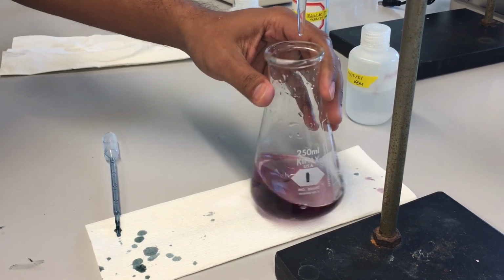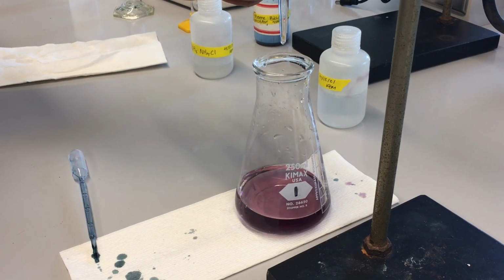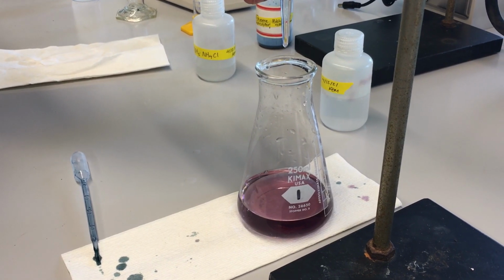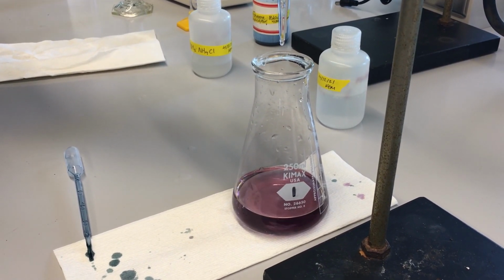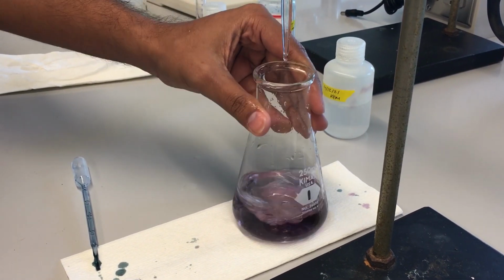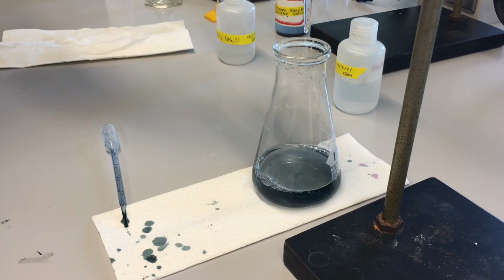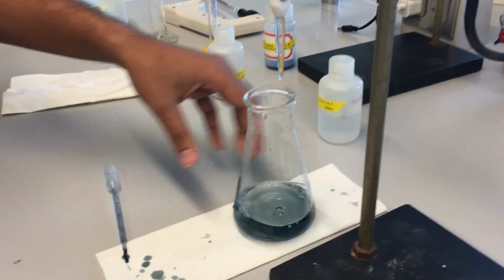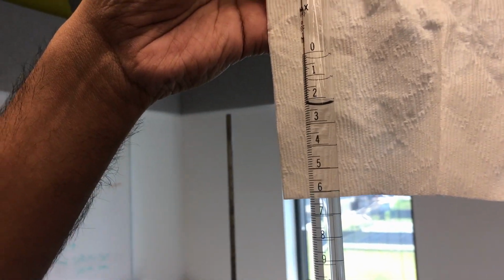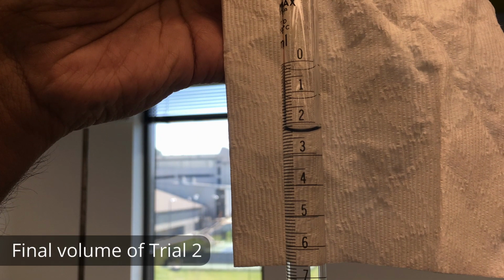All right, we will make sure it's homogenized and then start our titration. Of course, swirling constantly. And wow, that was very quick. As you see, it turned a nice blue color whenever the neutralization point was reached. We just used a few milliliters of EDTA, which means our water here in Georgia is not very hard. There you go. You can see the final volume there.